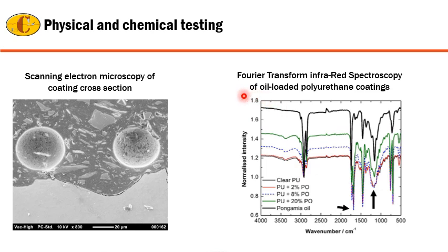So the use of this in the oil and gas industry is that you can actually do a good failure analysis of the morphologies of the cracking as well. So even in this case, the cracking can be seen if you polish it in the cross section, and you can actually see which pit or what kind of pits have led to the cracking.